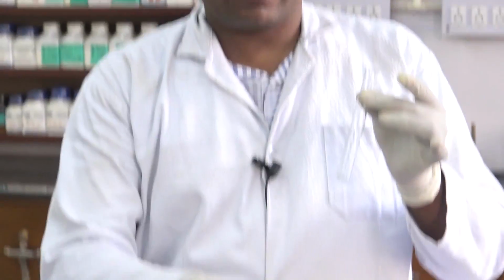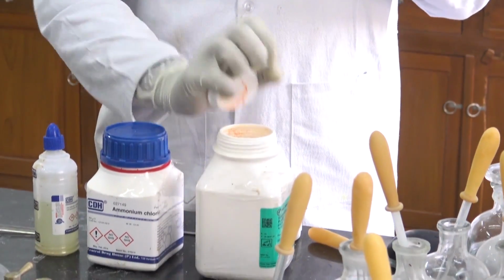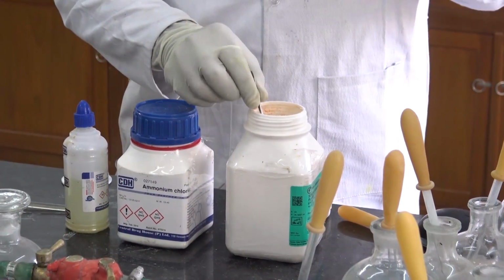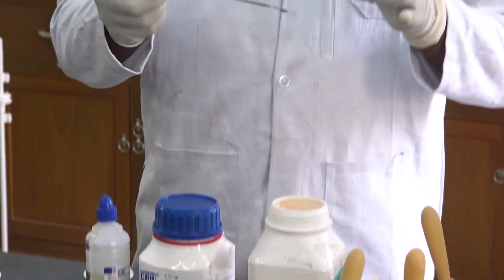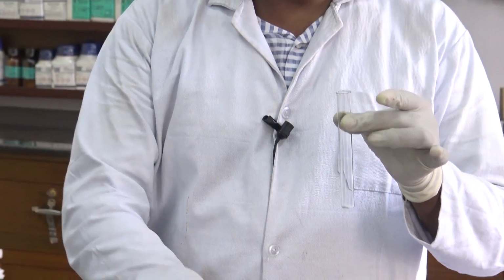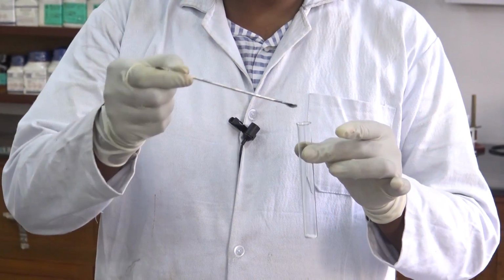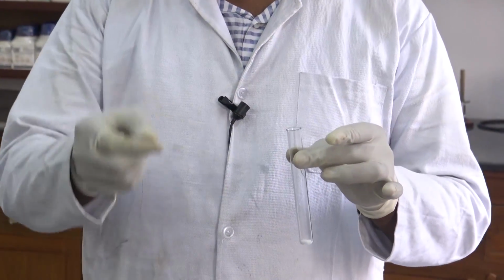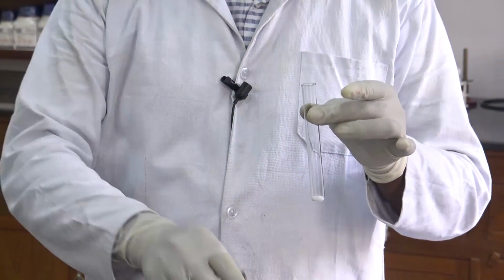Then add a small amount of solid sodium hydroxide flakes over the salt.